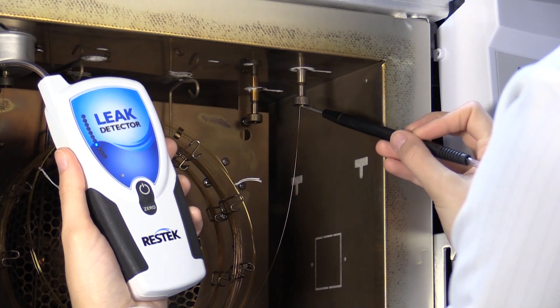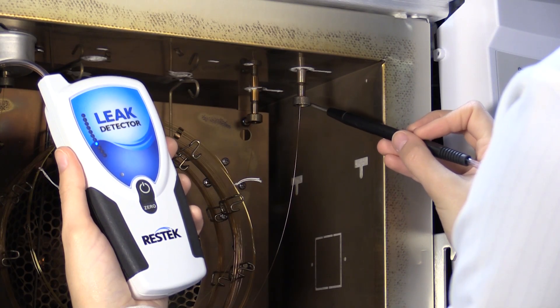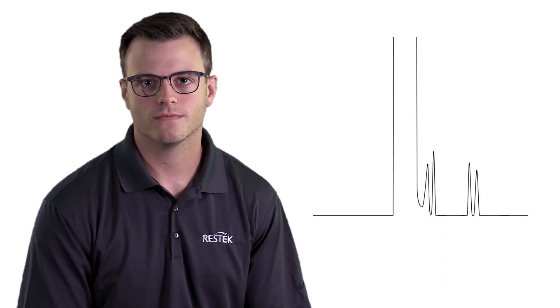After installation, check for leaks using an electronic leak detector. Another method for testing the installation is by injecting a small amount of solvent into the system. If the solvent peak tails excessively, then you should double check your installation. But if the solvent peak is sharp, you're good to go. Once you are confident with your installation, condition the column and begin running samples.